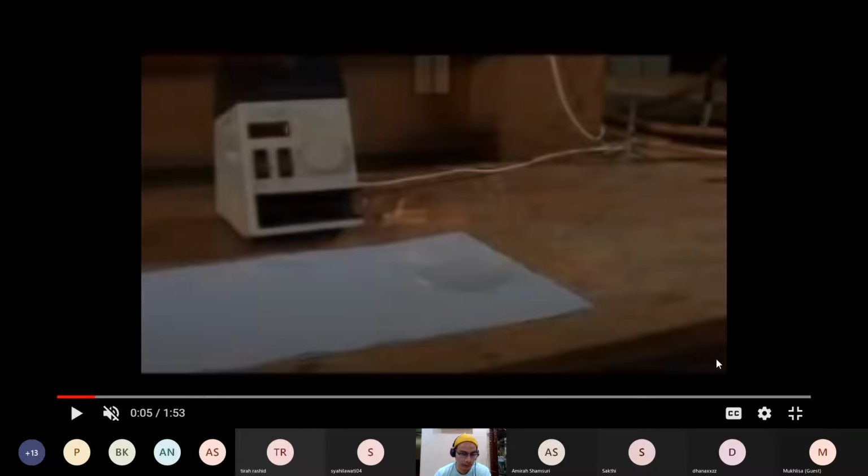They perform this multiple times untuk validate lah, untuk confirm betul tak betul 150. Adakah setiap kali kita panaskan glibenclamide tablet ini akan cair pada 150 darjah Celsius. So after they perform a series of melting point tests, setiap satu daripada yang cair pada 150, so they can confirm, they can make a conclusion that glibenclamide punya API melted at 150 degree Celsius. So that's how we know what we know in the pharmacopoeia.